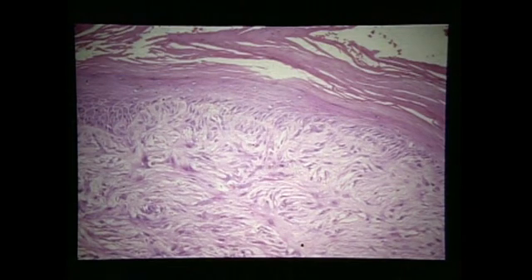Microscopically, it's characterized by the presence of small whorls or bundles of delicate fibroblast or fibrocyte-like cells that are oriented in a picket fence fashion at the site of the basal lamina and intimately associated with the epidermis. This is sort of a hallmark in the microscopic makeup of the equine sarcoid. Again, it should not be confused with a fibrosarcoma. It's the thumbprinting and the picket fencing that makes the equine sarcoid very typical and amenable for such diagnosis.